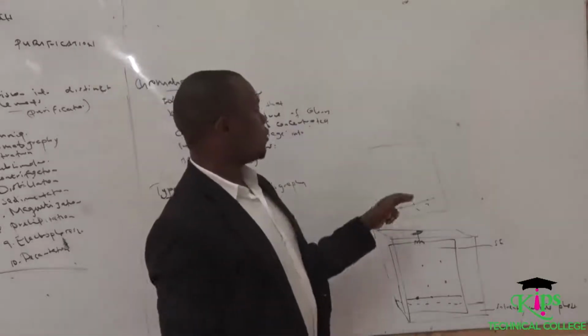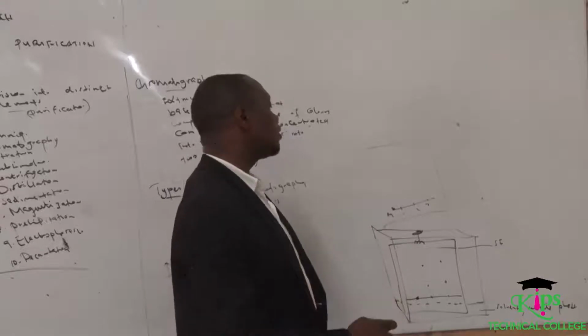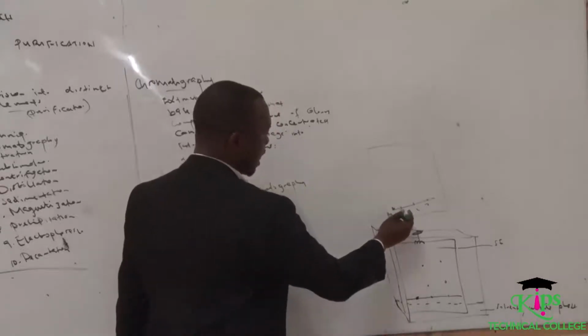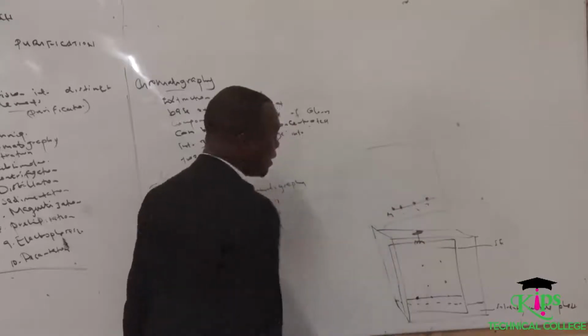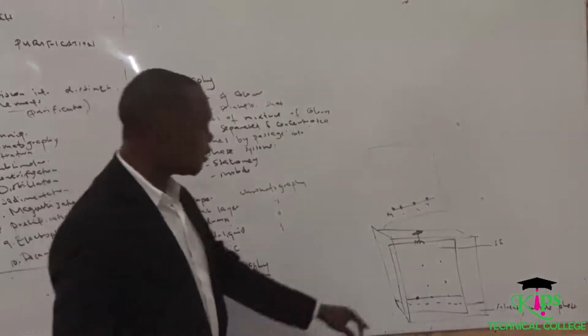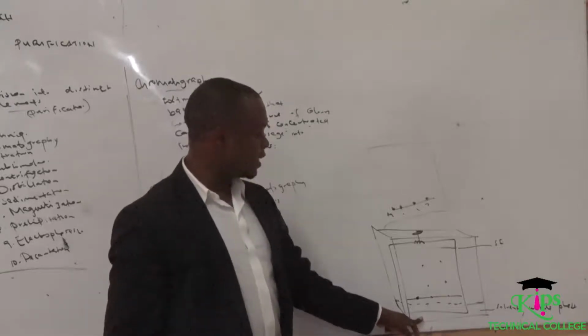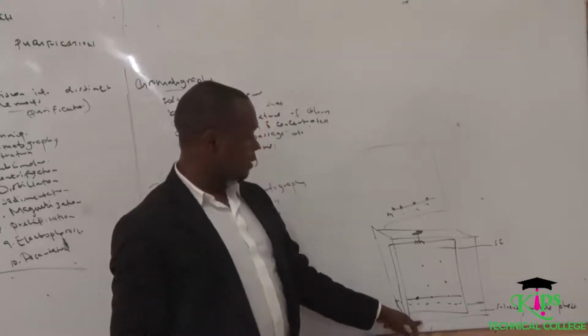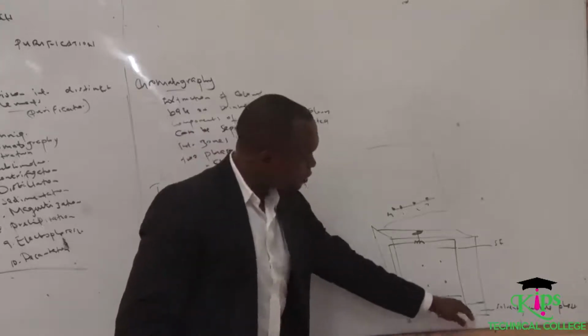We call this line the solvent line. Now, for the 3 pens that you will use to write, all of them blue, you place the ink at these points. And then you suspend your paper in a solvent container like this one, as in this diagram.